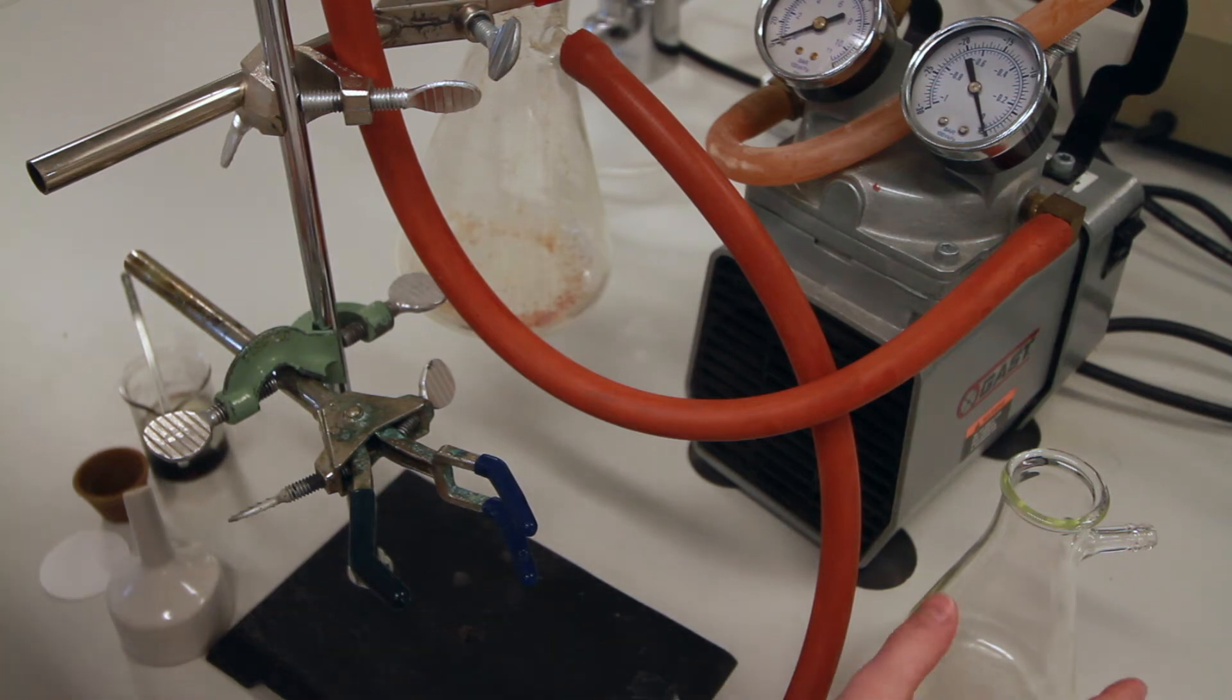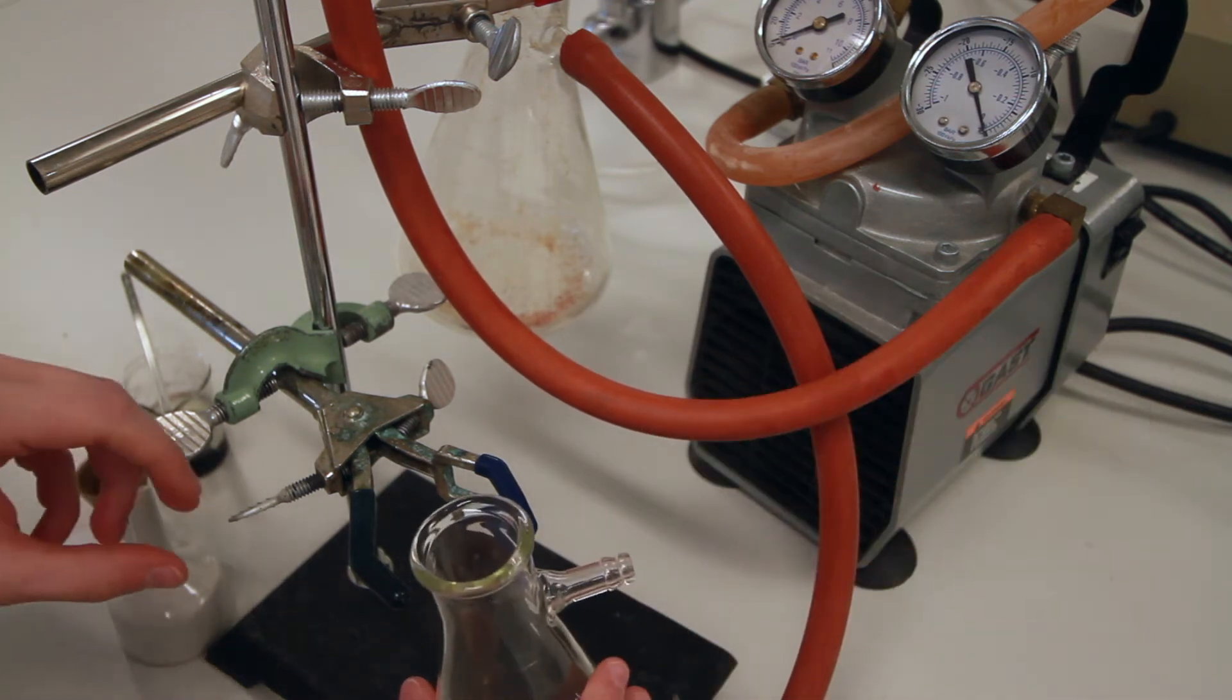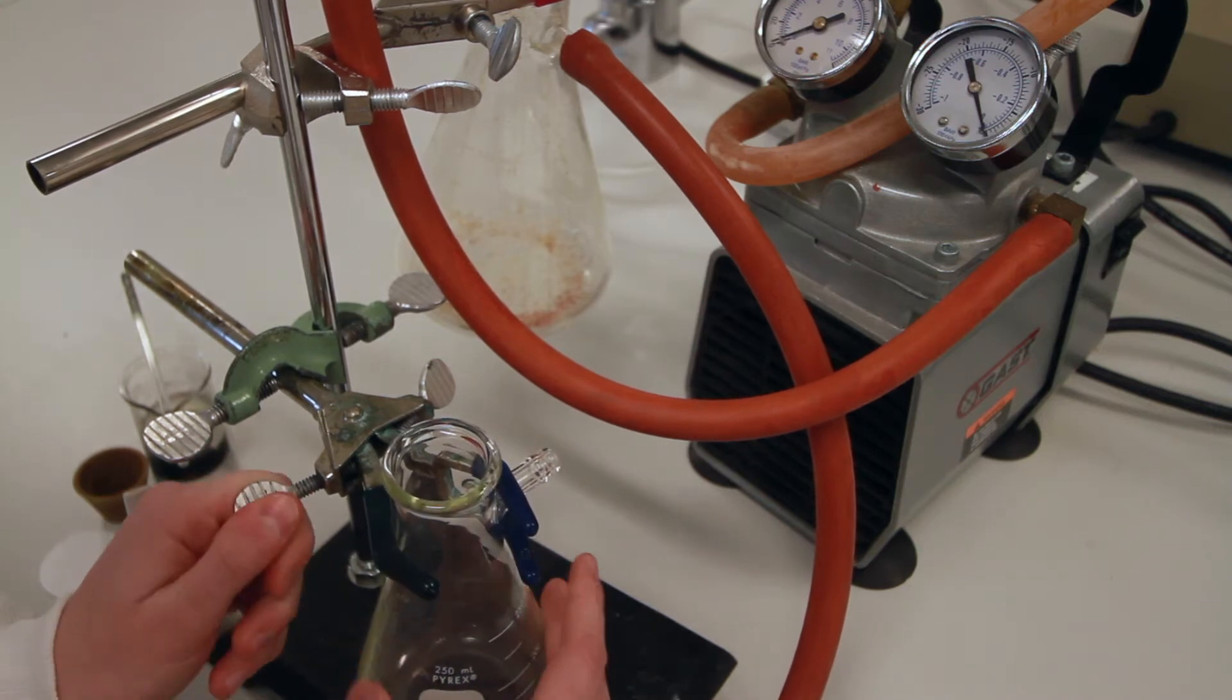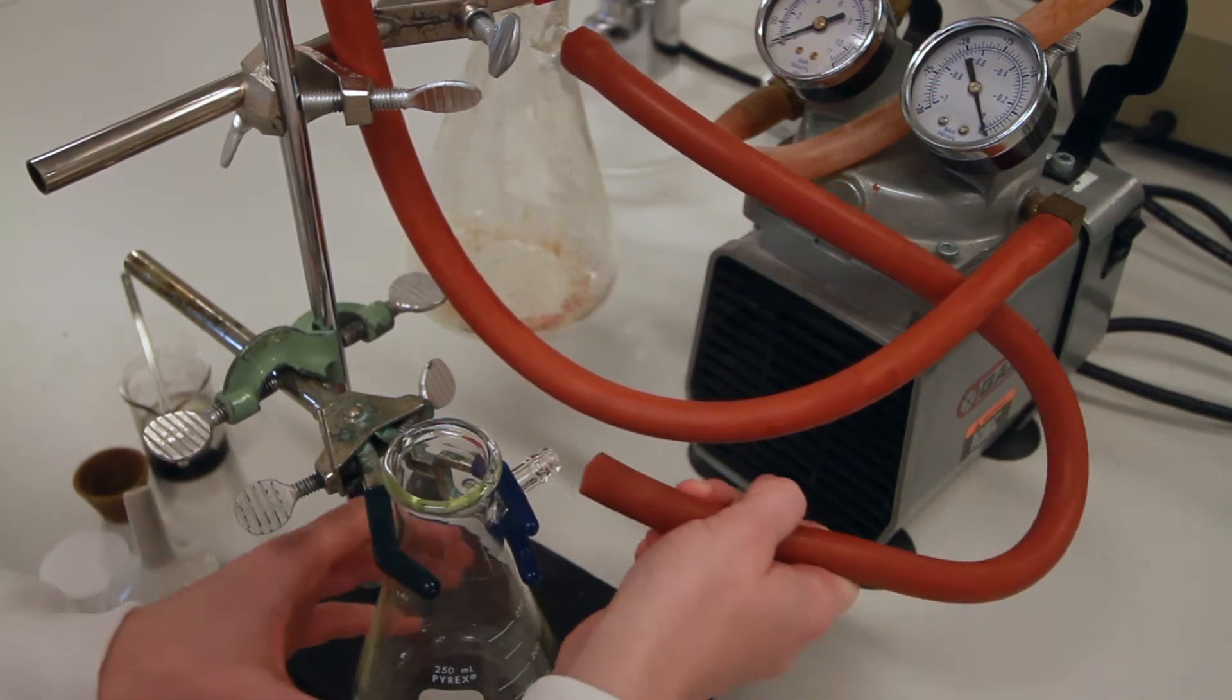To do a vacuum filtration, first start by getting your filter flask. Clamp it in and attach the rubber tubing to the inlet.